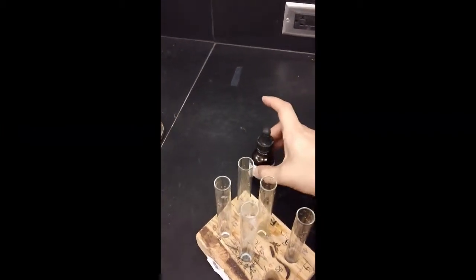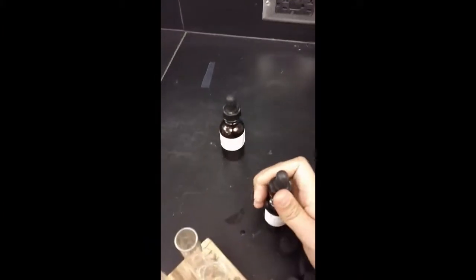And it looks like that bottle cap has a little broken, so I'm going to grab a different one. Never want to work with broken chemical bottles.